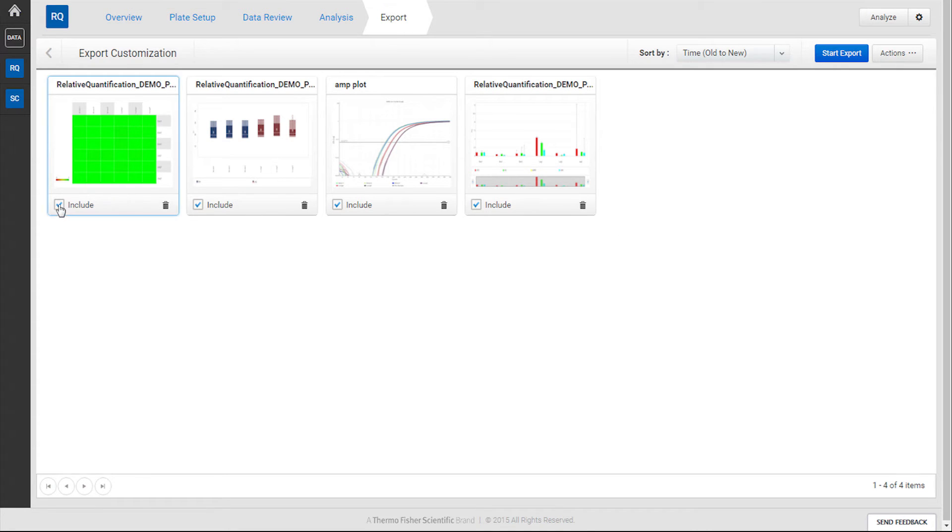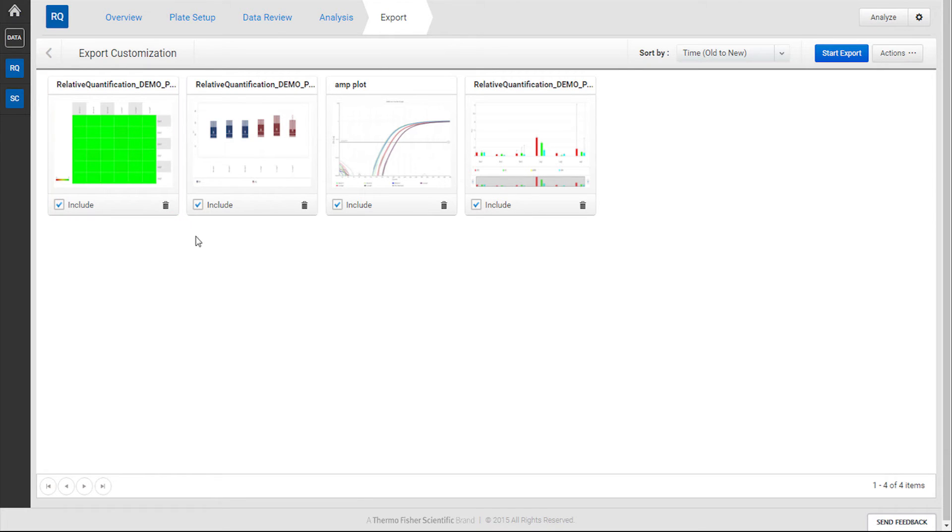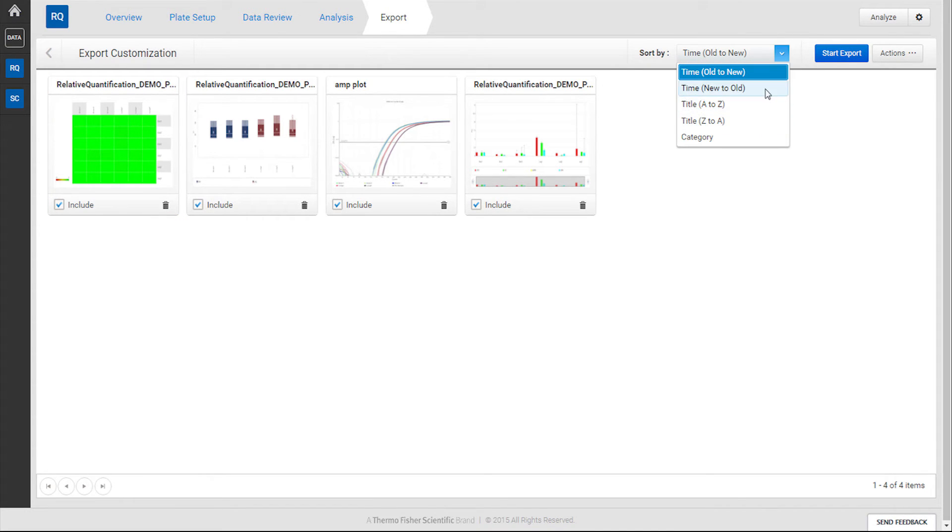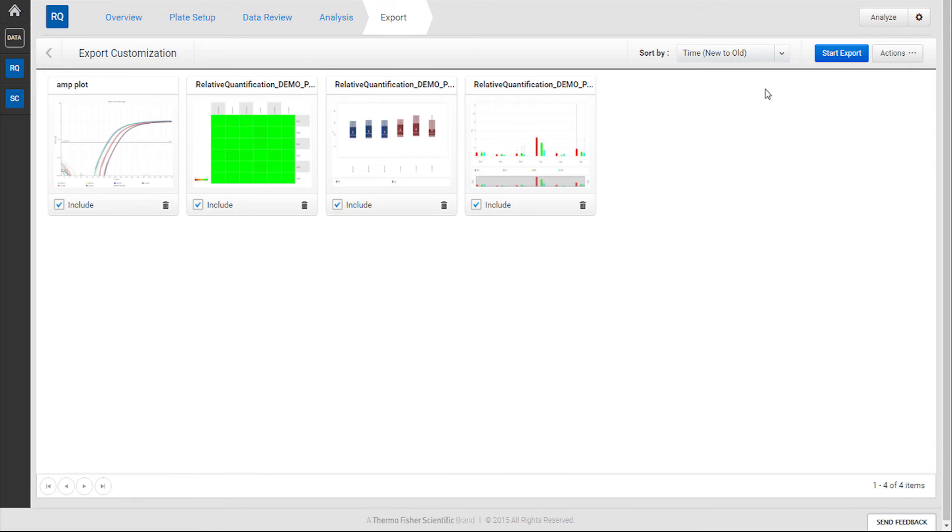On this screen, you can choose to include, exclude, or delete any images you may have tagged for export. You can also sort by various parameters such as date of tagging, alphabetical order, or category based.